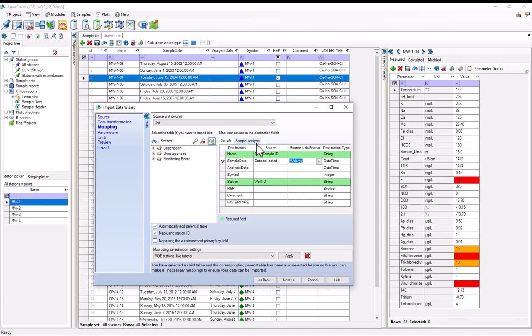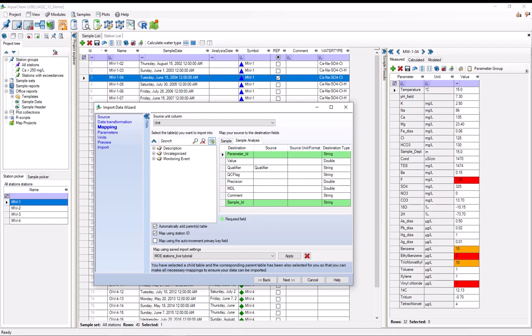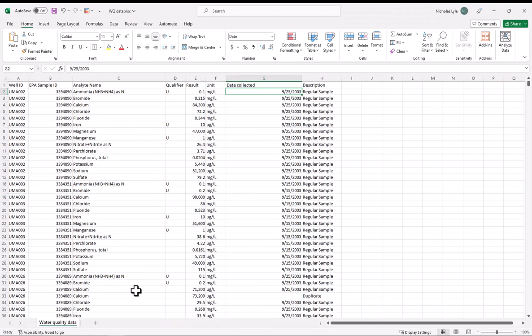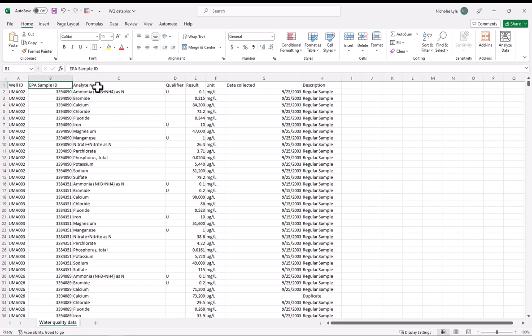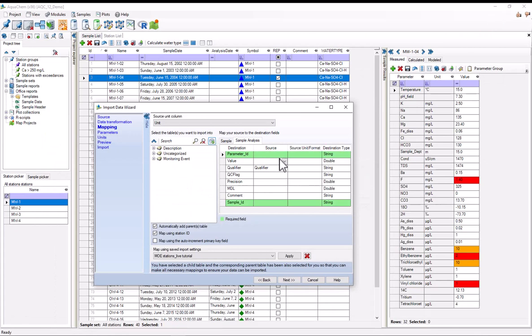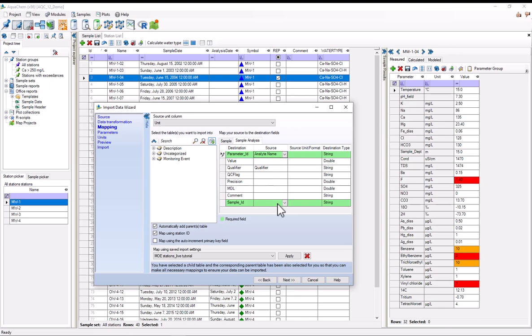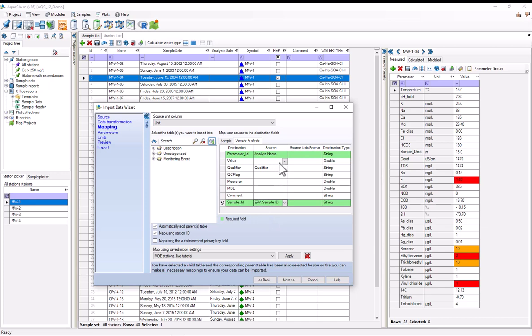And now I'll map the sample analysis table. So I'll just click that. And I can see that the two ones that I need to map are the parameter ID and the sample ID. And I'll go back and check very quickly. So the sample ID is still the EPA sample ID, and the parameter name, or the parameter ID is called the analyte name in the spreadsheet. So parameter ID, go to analyte name, sample ID, EPA sample ID. We also want to bring in the actual measured results. So for value, I believe it's result.